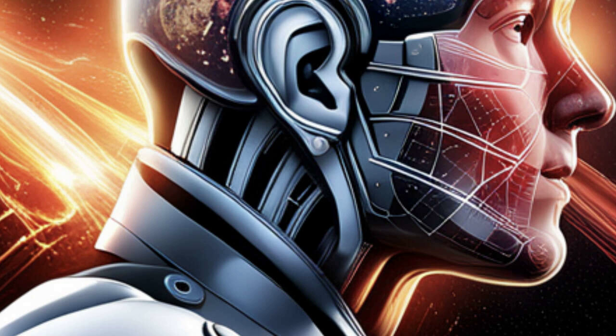To get all the details on this LCD digital coin microscope 1000x with adjustable LED lights, be sure to check out the article in the show notes. Don't miss out on this informative review that will help you make an informed decision about your next microscope purchase.